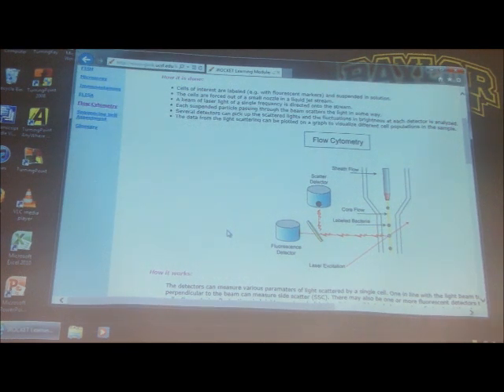The basic idea here is that you want to take individual cells, and you want to do a fluorescence measurement on every last cell. So what that means is, let's say that you're taking Lake Waco water, which is a wonderful pea green, and it has lots of different microorganisms. And let's say there is a surface antigen on a particular organism. I don't know, let's pick Salmonella, or maybe Giardia, your favorite pathogenic microorganism.